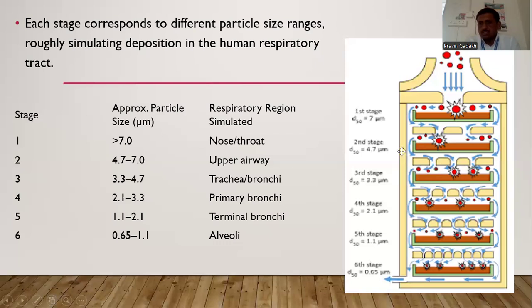As we discussed earlier, the opening of each perforation is similar within each section, but as we move downwards, the size of the perforation is reduced with respect to the particle size. When air enters a particular metal section, the larger particles get trapped on the first section.